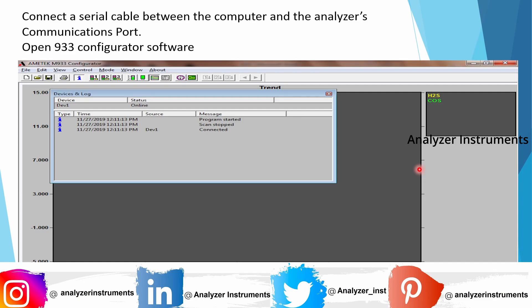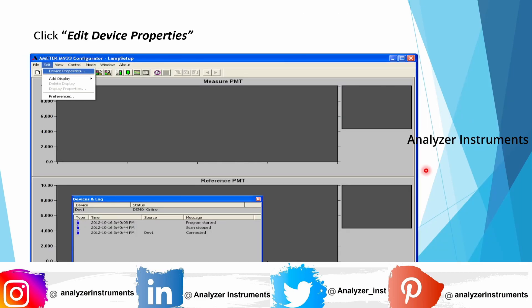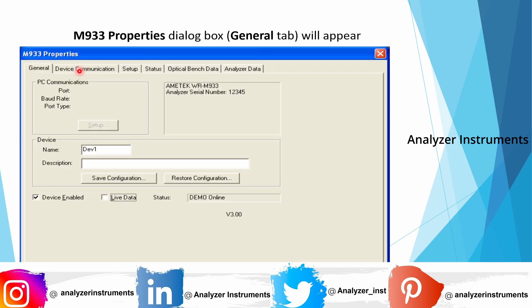Before adjusting the analog output, connect the serial cable between your laptop or computer and the analyzer communication port, and open the 933 Configurator software. Once you open the software, go to Edit and then Device Properties. This is how the general tabs look when you open Device Properties.